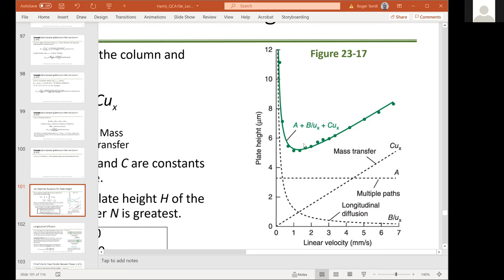I was going to say maybe around 2, just because there's more that are kind of averaged around that 1. Aha. That's the right answer, but the wrong reason. The reason that you would choose 2 is because your separation happens in half the time. That means you can get twice as many injections done per day. It's sort of a weird technical point, right? But it becomes important in separations, because it's something that places tend to do over and over, right? So if you could go between here and here, you might want to exceed the optimum just a little bit. There could be a little bit of peak tailing, but you can deal with that, right? Okay, cool. I see that I have exceeded the maximum allowable bullshit session on this. But this is important stuff.